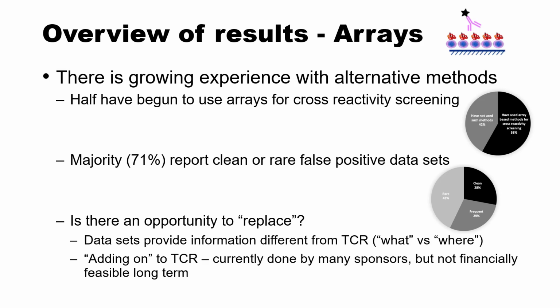Certainly, some have suggested, well, we could just combine this with a tissue cross assessment, which some do. Certainly, we at Novartis, for non-oncology indications, are currently combining this with the tissue cross. But looking long-term, this does not necessarily seem to be financially feasible in the long term.